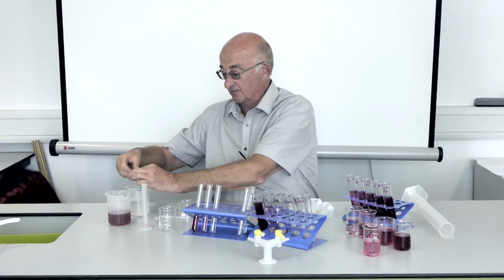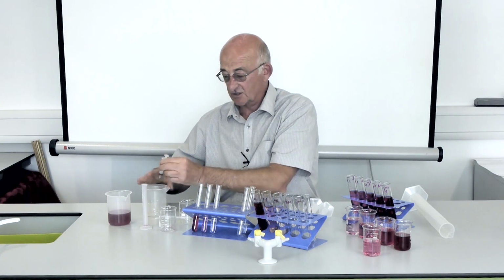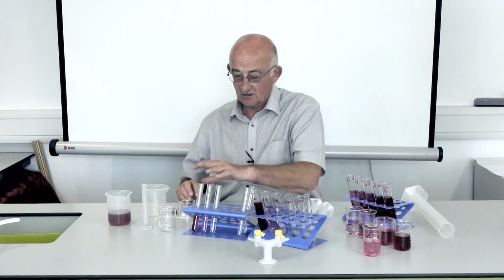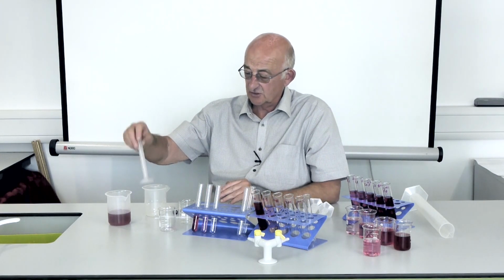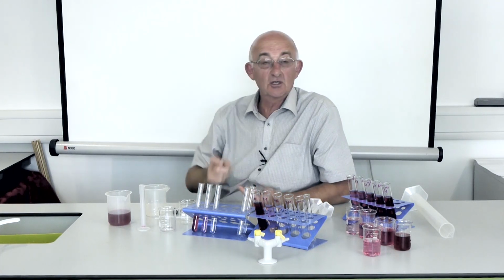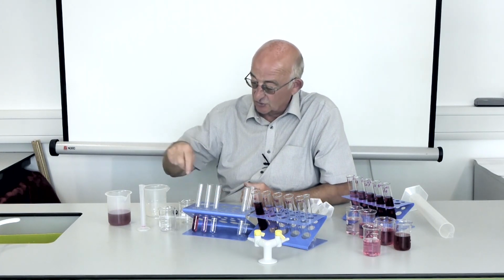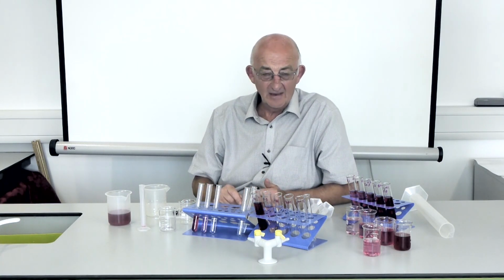So I've got my washing up beaker, and I'm swilling that and getting rid of that every now and then and putting some more washing up facility in. So I'm trying to eradicate the effect of these little dribbles of contamination. That will show you something with a glucose detection, how significant those little drips might be in terms of throwing out all of the results. More about that in a little while.